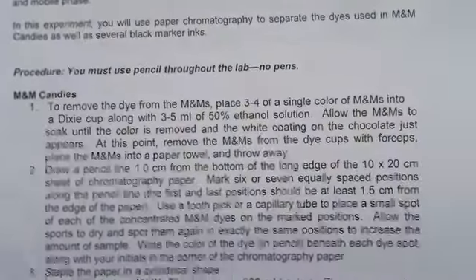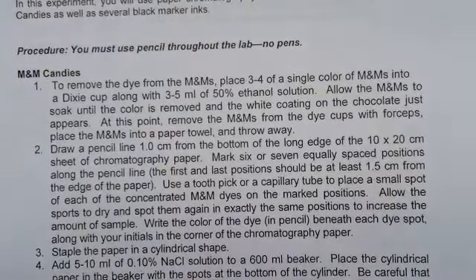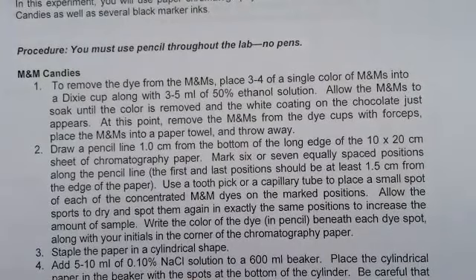So we'll just set that in, gently put the parafilm back. And then we just let it go until the mobile phase is about 2 centimeters from the top of the paper. That will definitely give probably the time it'll take once we're in our stations, at least probably 15 minutes to do all of the measurements we need.